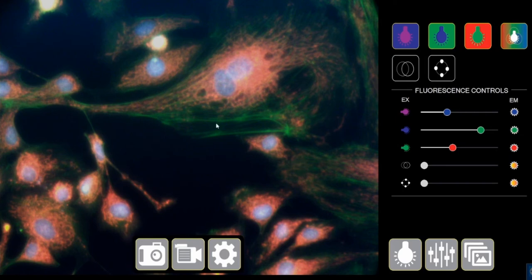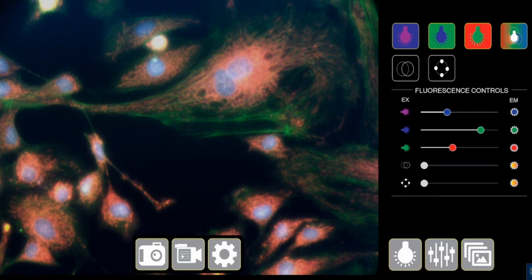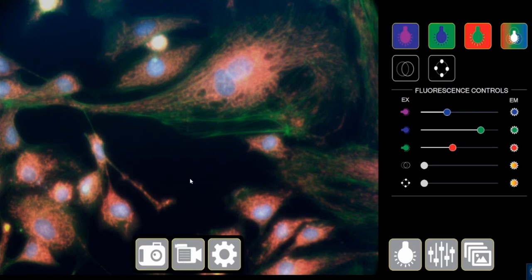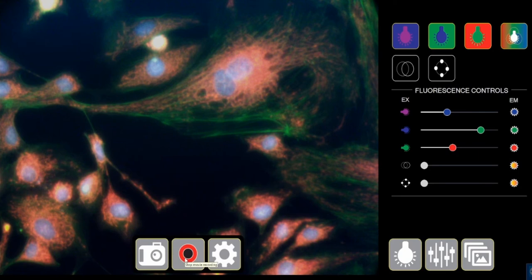This is basically a live screening mode that I just mentioned. This is your video recording button. You can use this to do time-lapse imaging for longer experiments. You can click on this and it starts recording a video. You click it again and it stops recording the clip.